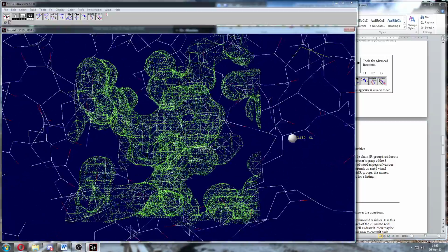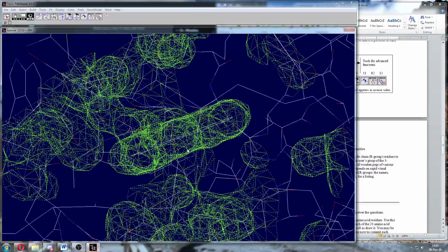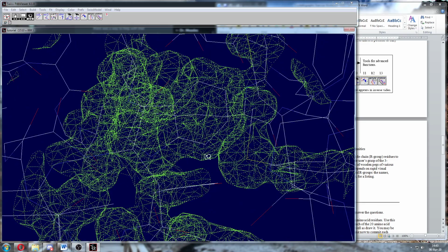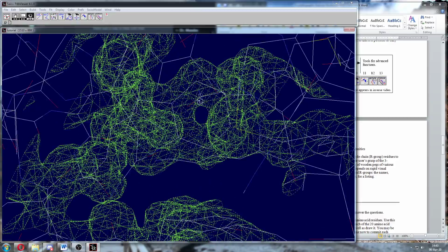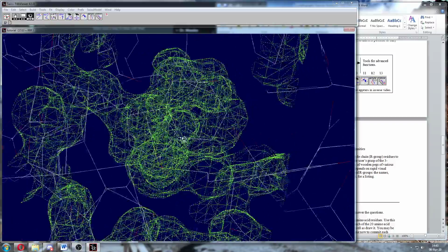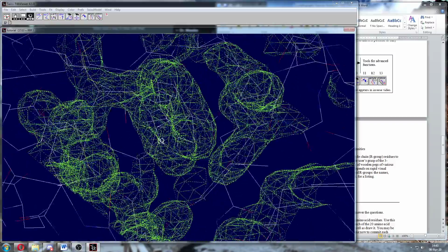Right? And tryptophan's 2 rings, as you see here, are truly planar. Right? You see the density looks nice and flat. Right? You can even see the hole in the middle of the benzene ring from the density. There is no physical space in there, but as far as we rendered the density, it exhibits a hole. Right? The 5-membered ring is not quite big enough to generate a hole by this resolution, but you should see a dimple where it goes in. It's a torus.